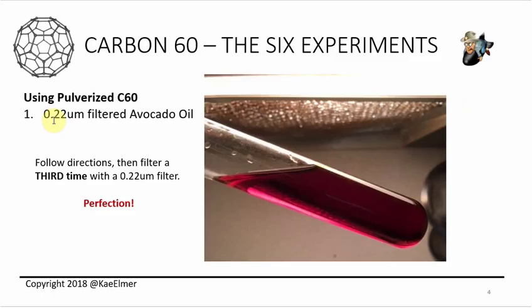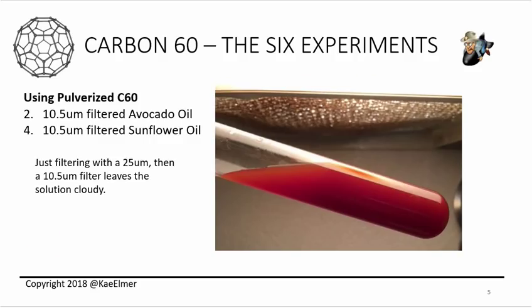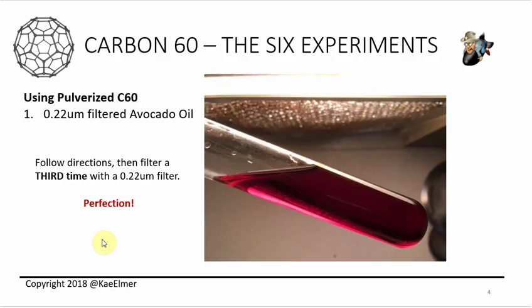This time, though, I used a much, much, much smaller filter, a 0.22 micron filter, and this is what was extracted from the solution after 2. So this is what I have found out. And by playing around with my sonicator, I've discovered that 45 minutes is pretty much the best time. So 45 minutes, keeping it around 102 degrees, 105, around there, and filtering it a 3rd time, and you will come out with this gorgeous purple C60 oil, full of lipofullerenes, and it's literally a commercial grade product.